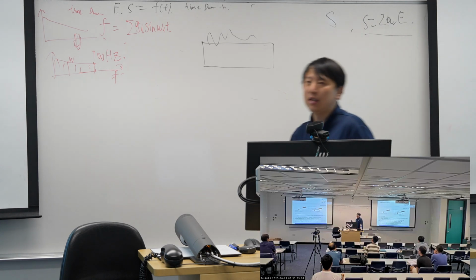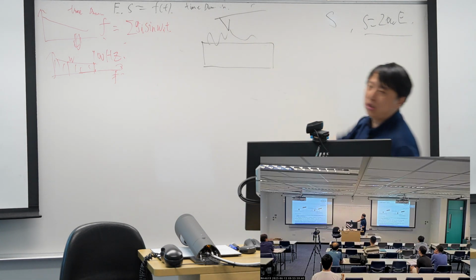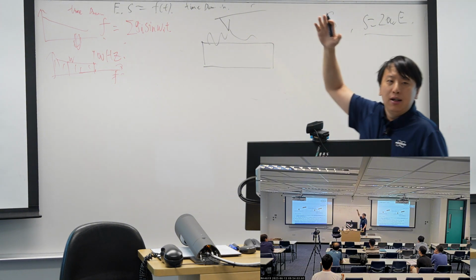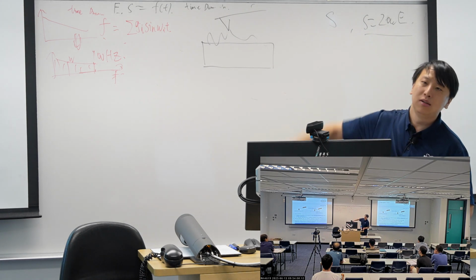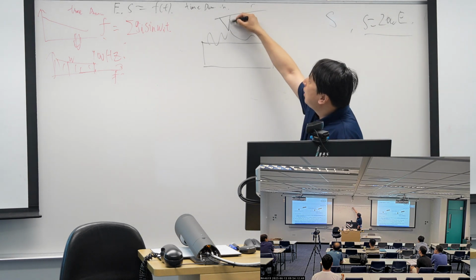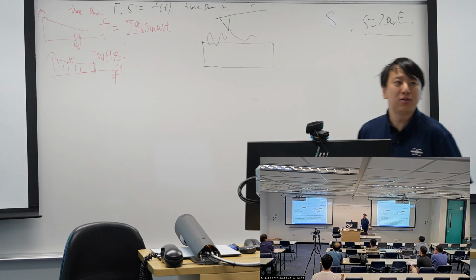And for stiffness, it is force and deformation. So we have our stylus, which is the AFM probe, and we can apply a theoretical force on the samples. But again, we cannot directly control the force.